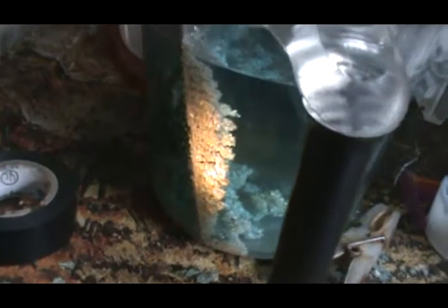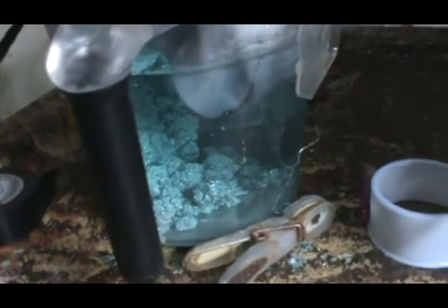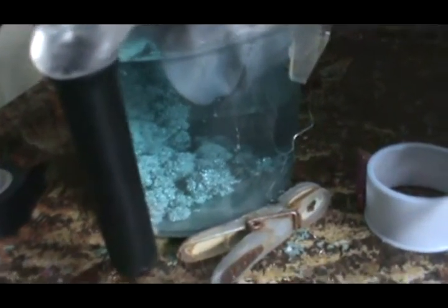Over the next couple of days I'll show you the progress of the crystals. Right now they're doing pretty good. We'll be back in a day or two and I'll show you the crystals that have built up.